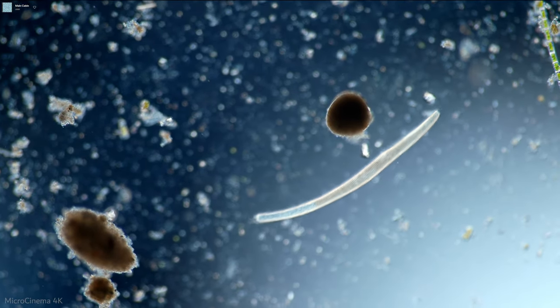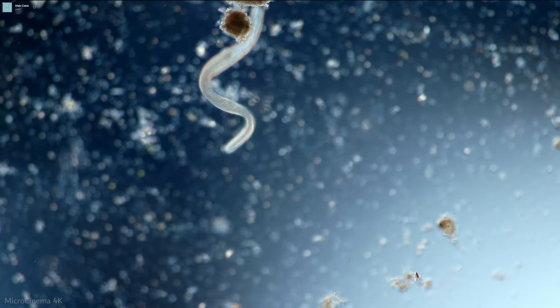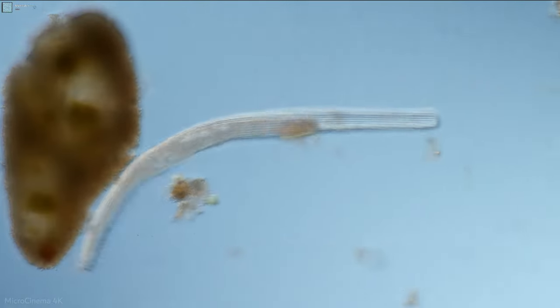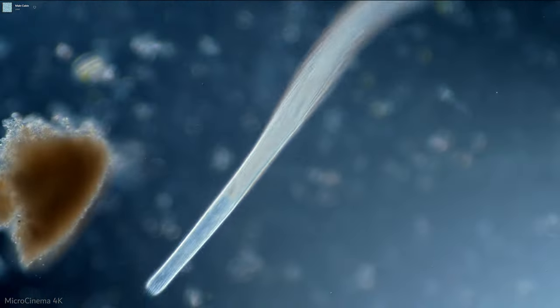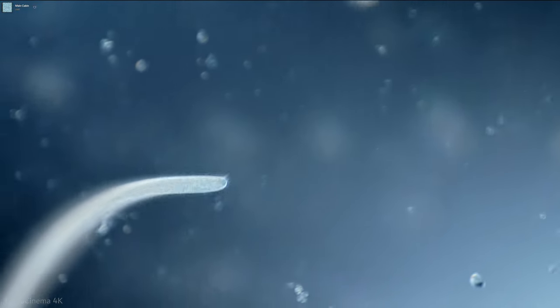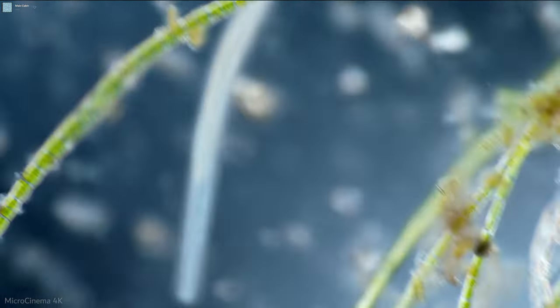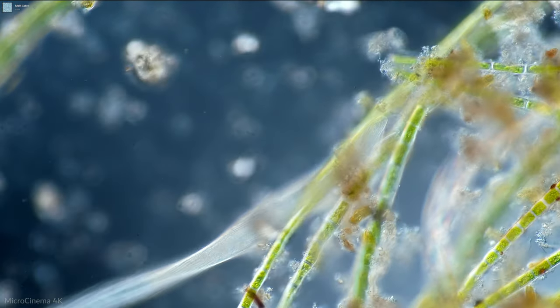Of course, this is a real classic. Find these in a lot of freshwater samples. This is Bursaria... Spirostomum. When I first saw these, I thought maybe they'd be Gruberia, which are sort of a Spirostomum analog that you find in marine samples, but I think this water here from Bay Point is just a little bit salty. So I think we're getting freshwater organisms in here as well, or some classically freshwater organisms.